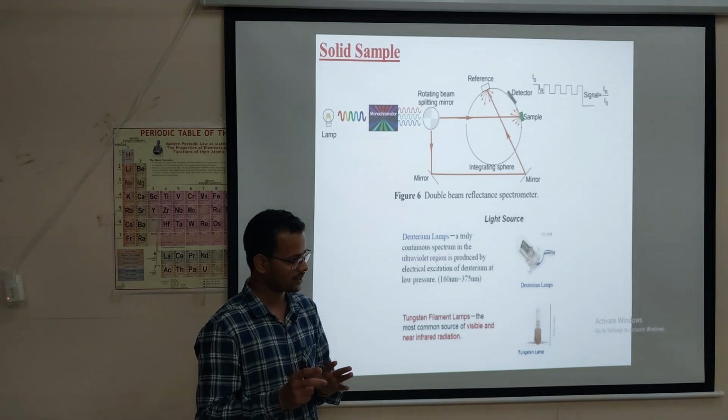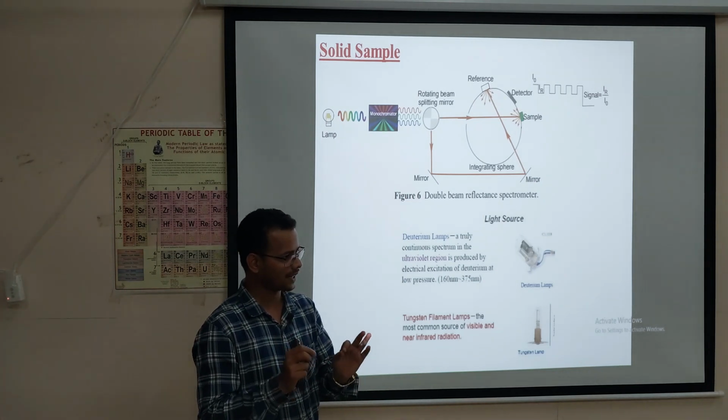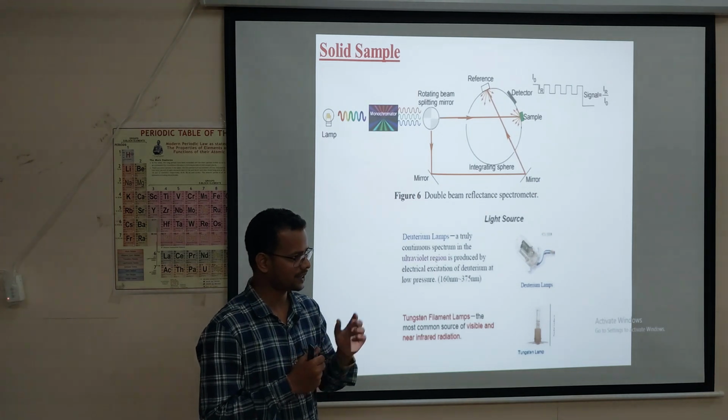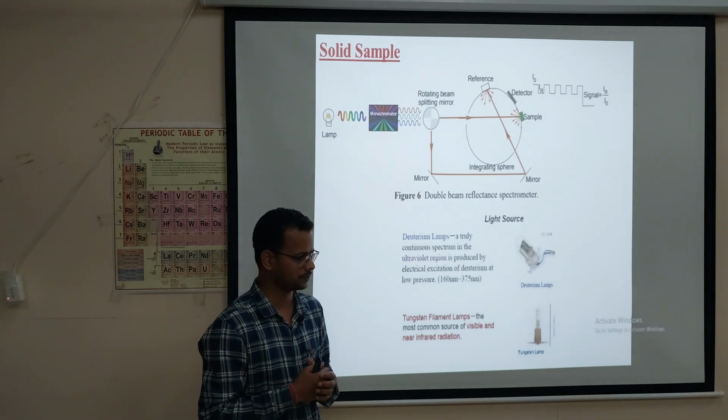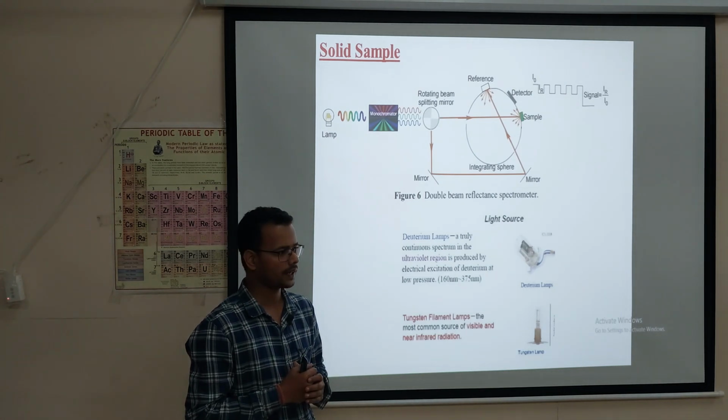Okay, for solid sample characterization, we use barium sulfate. We first have to standardize by using barium sulfate as the reference. Then we will do analysis of any sample.